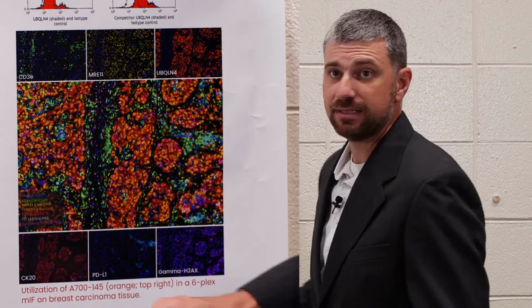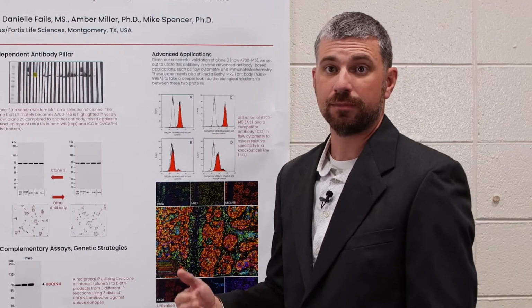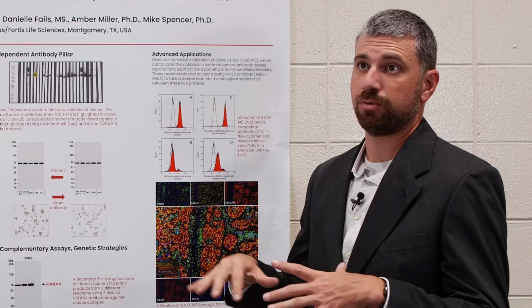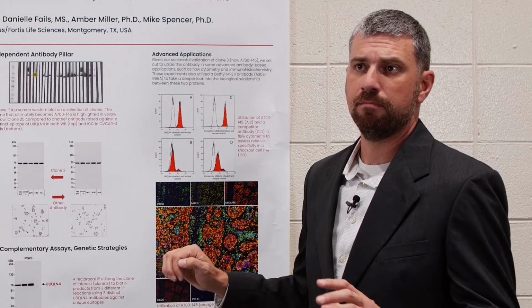So taken at large, we are now able to conclude that UBQLN4 is in fact localizing as expected, and our antibody is performing well, it's performing specifically, and it is performing in a way that is broadly applicable across multiple types of applications.